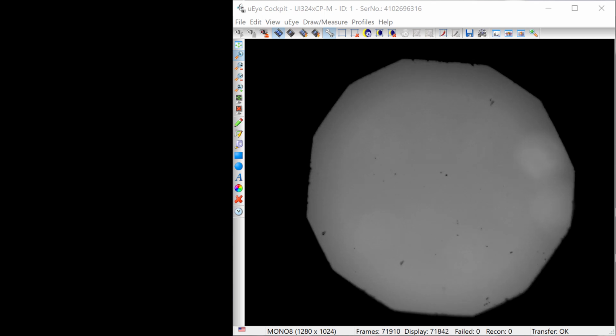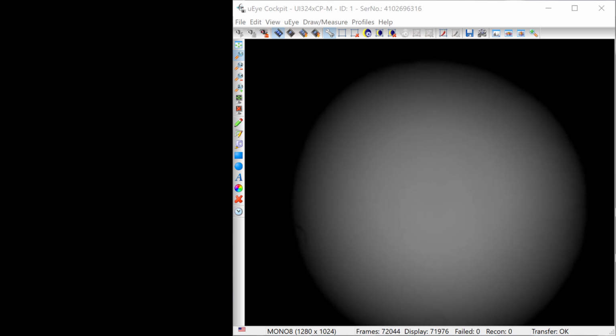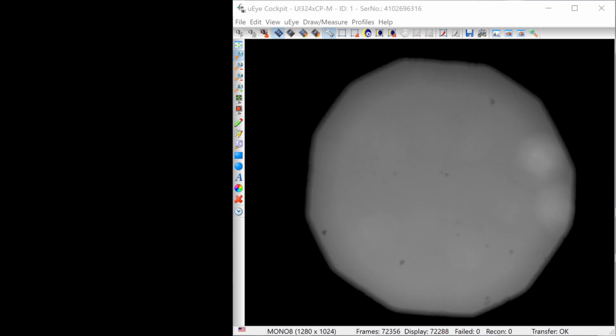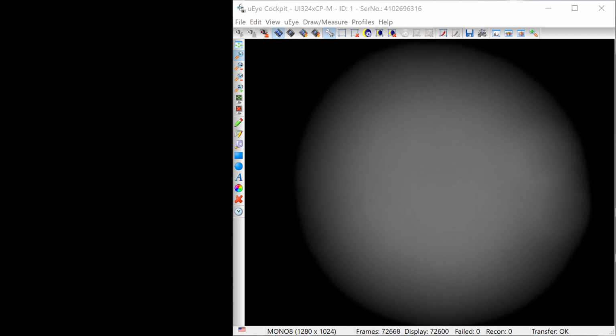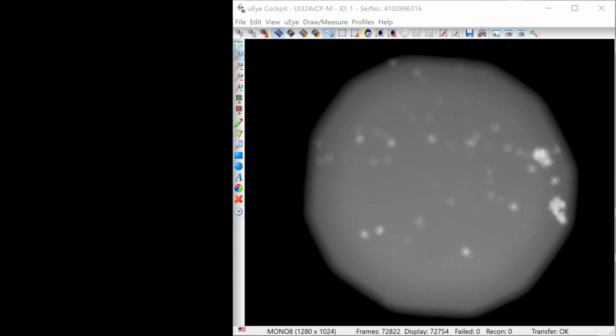After a short distance, the image of the field stop comes into focus again, even though the specimen is not in focus. At this point, the objective's focal plane coincides with the underside of the cover slip, which is another optical interface that produces a reflected light image of the field stop. Focusing down further or back up and above the specimen plane confirms that there are no other interfaces at which an image of the field stop could form.